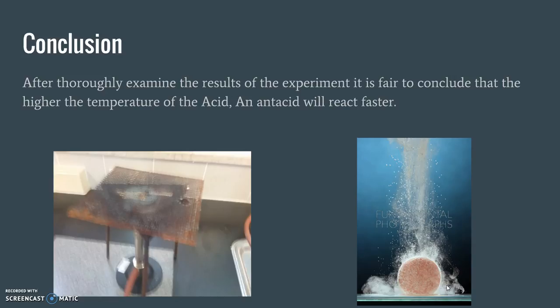To conclude, after thoroughly examining the evidence of the experiments, it is fair to conclude that the higher the temperature of an acid, the faster an antacid will react.